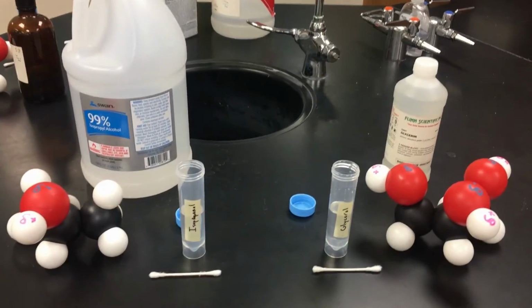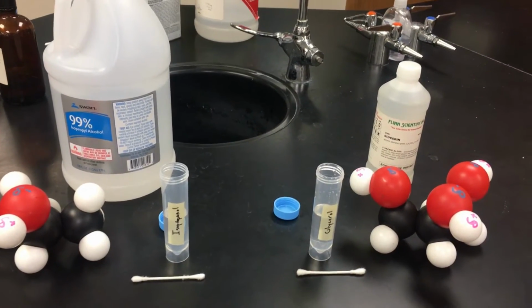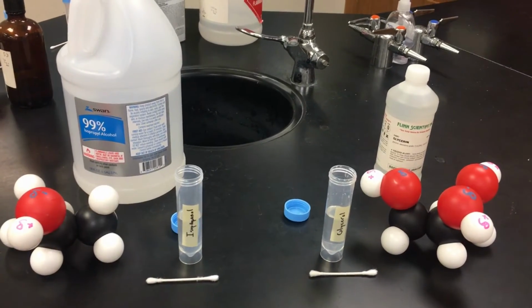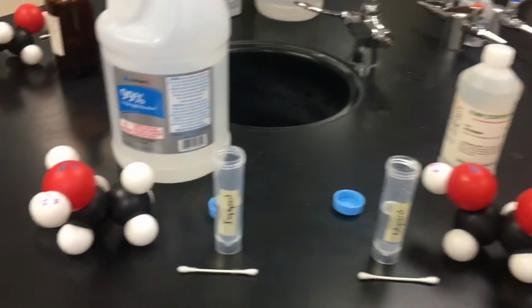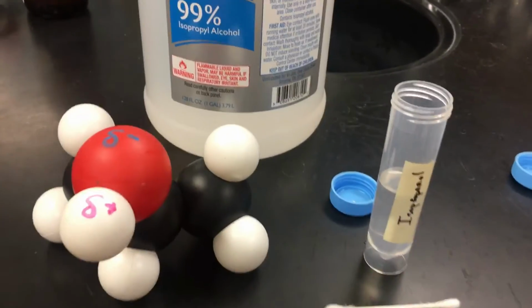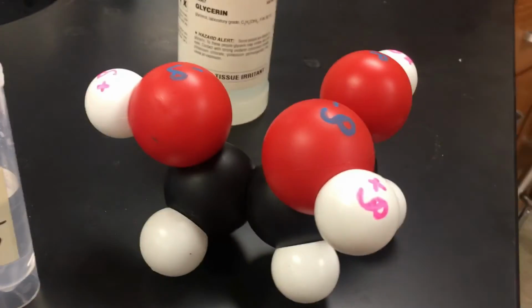Let's do one more comparison with this special dipole-dipole attraction we call hydrogen bonding, which again is not really a type of bonding, it's just another intermolecular force, and it's badly named. In this case, we have rubbing alcohol, aka isopropyl alcohol, also known as isopropanol, along with glycerin, also called glycerol, which is right here.